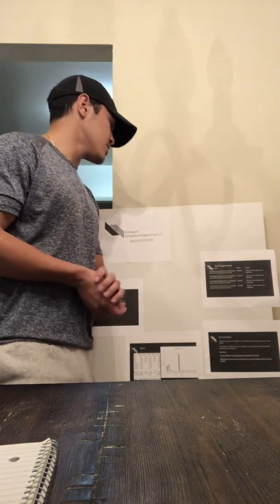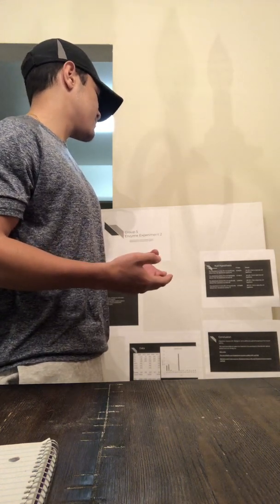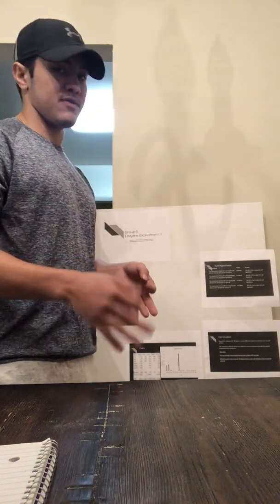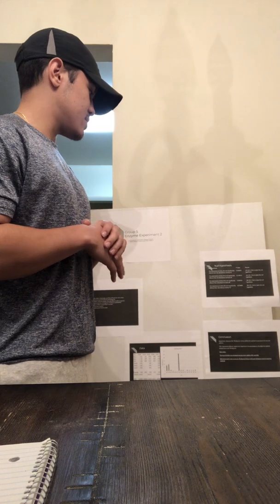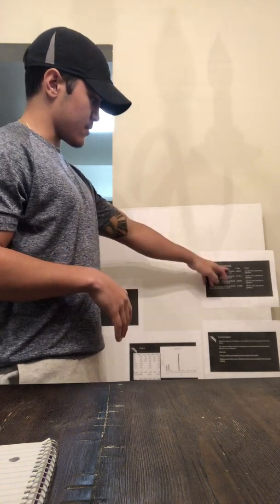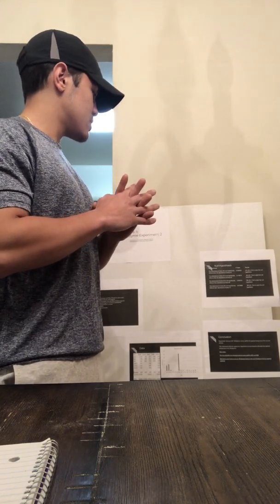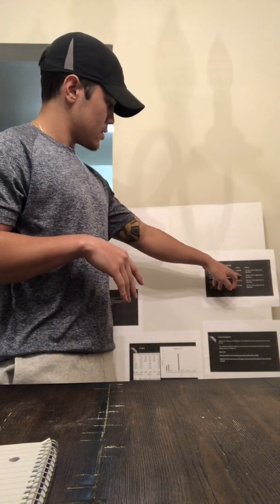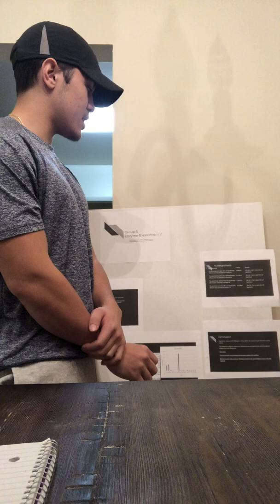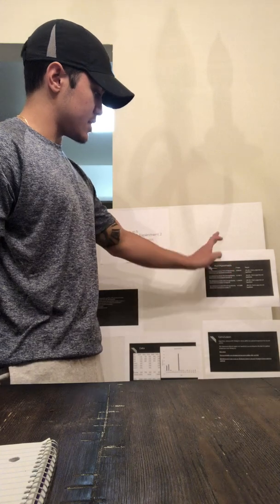Now, with our null hypothesis, we found that the absorbance at a temperature of 30 is not significantly different than the absorbance at 40, and so on from 40 to 50, 50 to 60, 60 to 70. There was no significant difference in absorbances between temperatures. Once we calculated our p-values, each p-value was higher than 0.05. Because they were higher than 0.05, we had to fail to reject the null hypothesis for each and every single one of them.